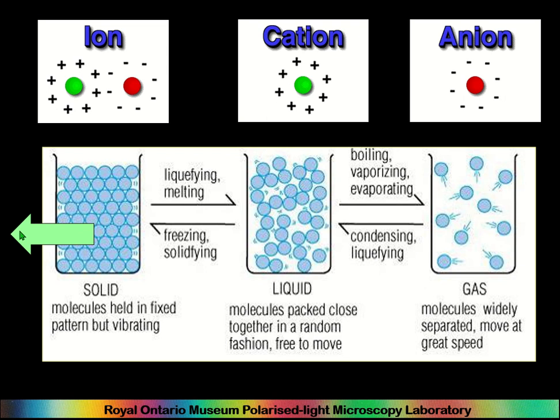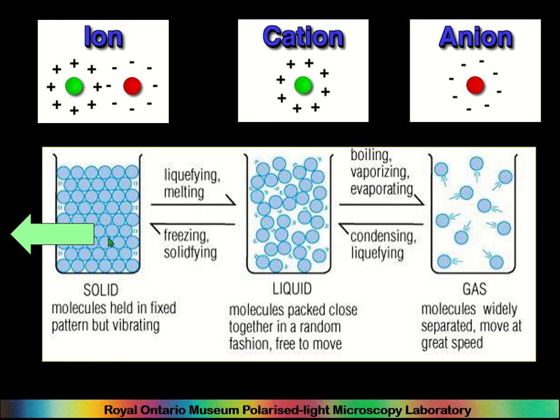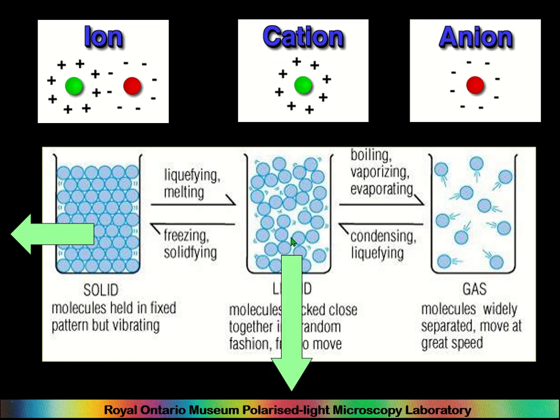But you have something over here which you know quite a lot about now, which of course is crystals. Crystals are more solid than solids. They are in a crystalline state. And you have something down here. You have a supercooled liquid, and that's what glass is, including volcanic glass. The structure of it is completely random.